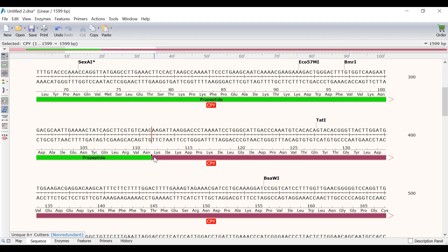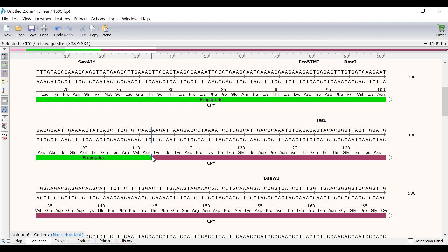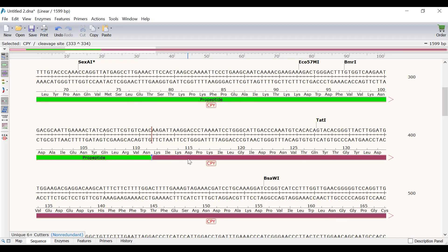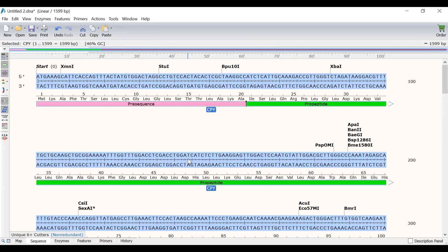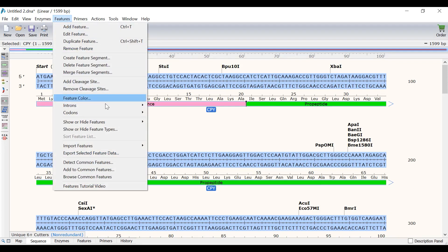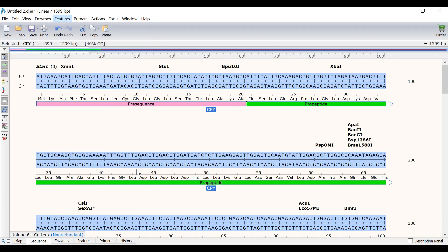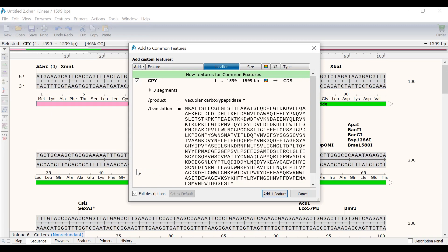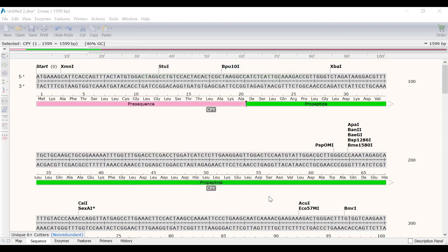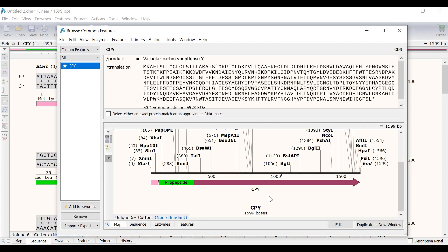If you are working with the same feature quite a lot, then it is possible to save it as a custom feature to enable automatic annotations in the future. To do this, I will click on the feature to select it. Then go to Features, Add to Common Features. With the CPY feature selected, I will click on the Add One Feature button to save it. Doing this will open the Browse Common Features window.